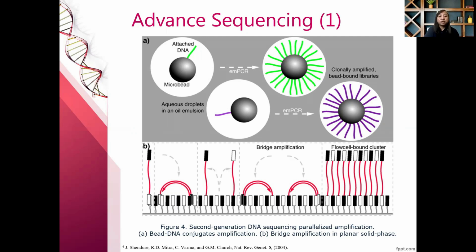The B picture shows the process of immobilization in planar media. The template DNA strands were attached to the planar media and then amplified by the bridge amplification method. In that way, on the planar medium, similar DNA clusters will be formed.